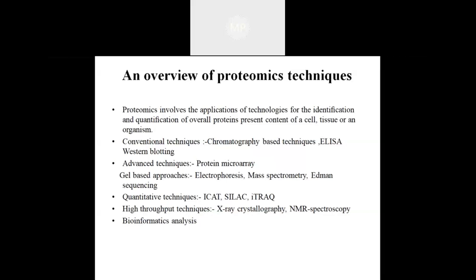The quantitative techniques include ICAT, SILAC, and iTRAQ. And high throughput techniques include X-ray crystallography and NMR spectroscopy and so on.